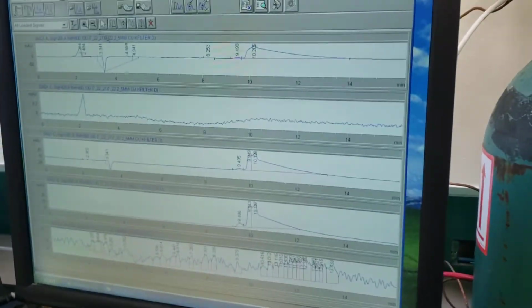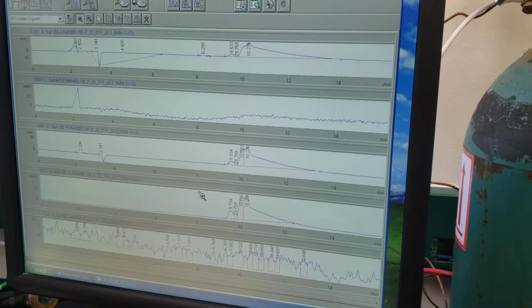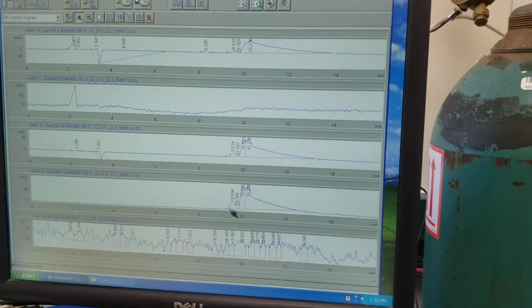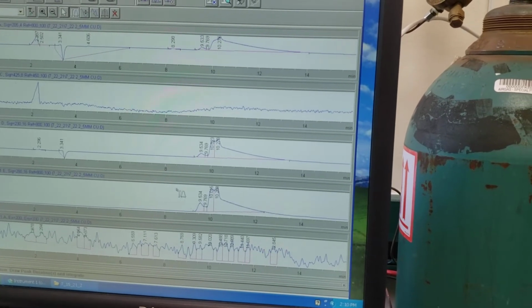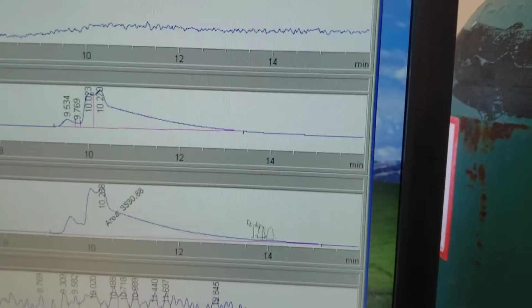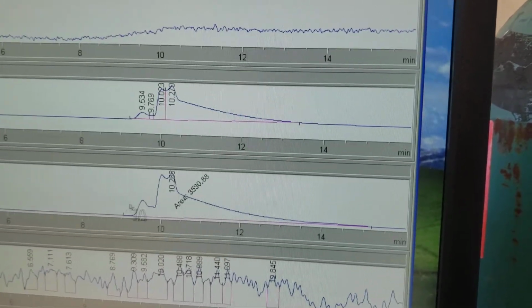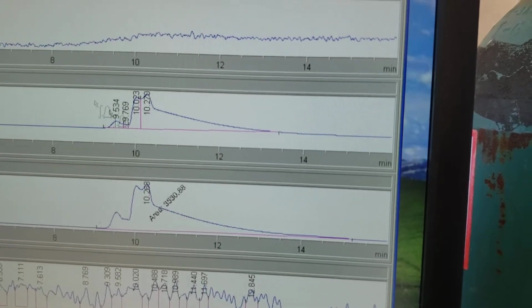This was the copper sample before the filter, and this represents all the copper material, the different copper species bound to the EDTA in our assay to determine how much copper there is. So we get an area under the curve at 280 nanometers absorption of 3,530.